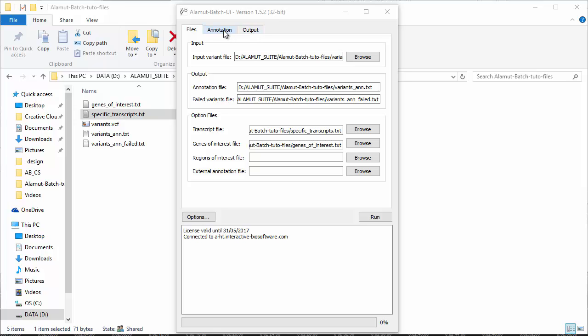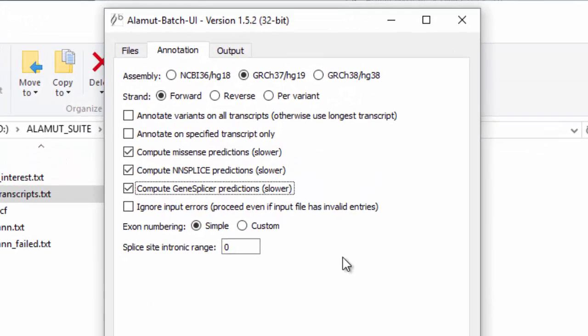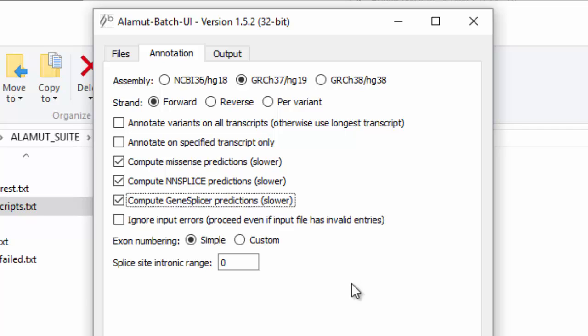For the annotation settings, go to the annotation tab and select the assembly your variants were called on. By default, Alamut Batch annotates variants on the longest transcript available in the Alamut database. You can choose to annotate all transcripts available or to annotate specific transcripts only. Missense and some splicing predictions can be computed optionally.